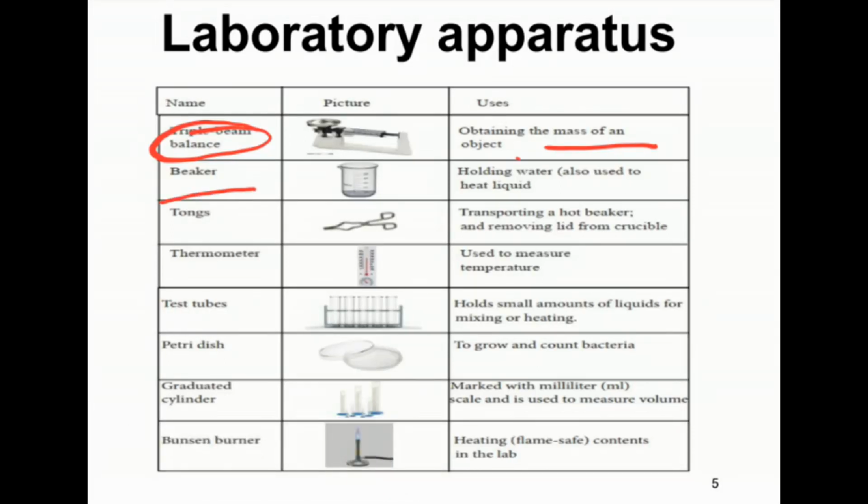Beaker. So beaker is used to holding water. And it is also used to heat liquid.